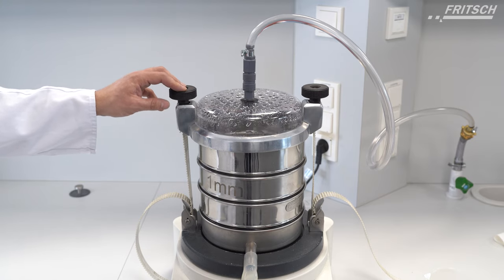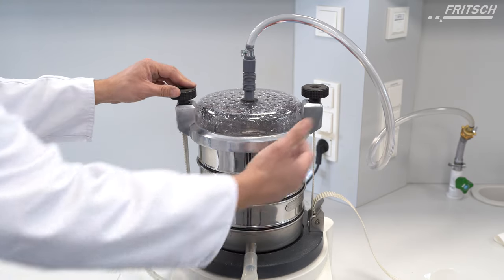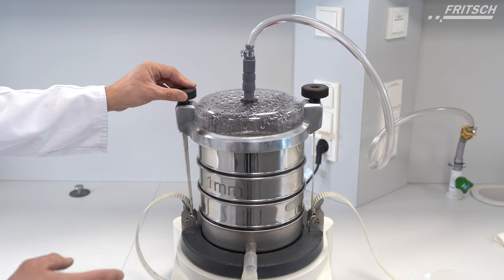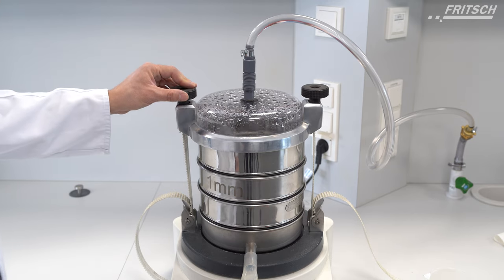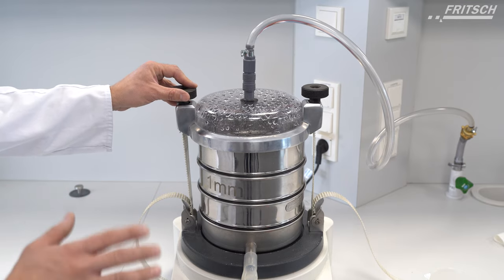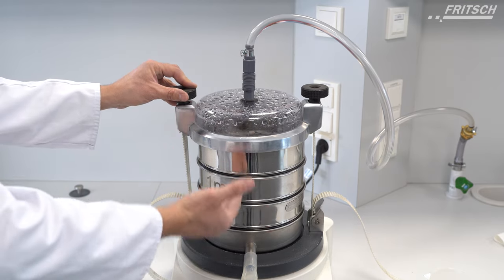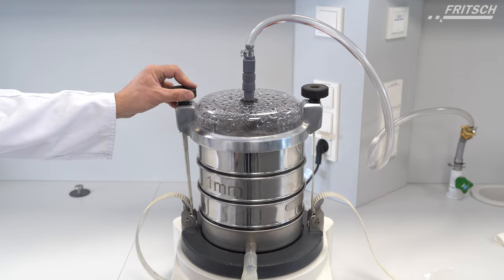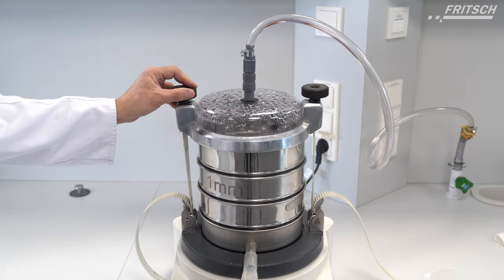Again, it is very important to have everything very tight. If no suspension is coming out, it is necessary to stop the process, because there is a risk that one of the sieves is clogged and no water can pass through.